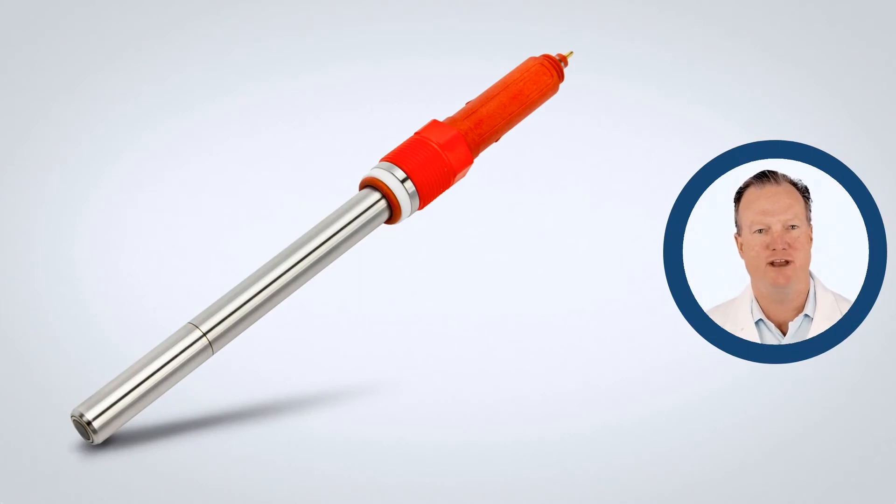The INPRO 5000i inline CO2 sensor features Mettler Toledo Intelligent Sensor Management Digital Technology and is designed to provide accurate dissolved CO2 measurements and meets all bioprocessing requirements.